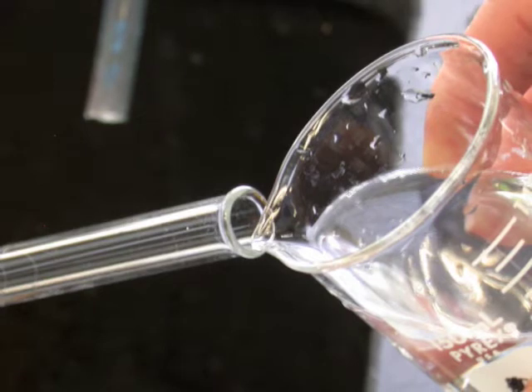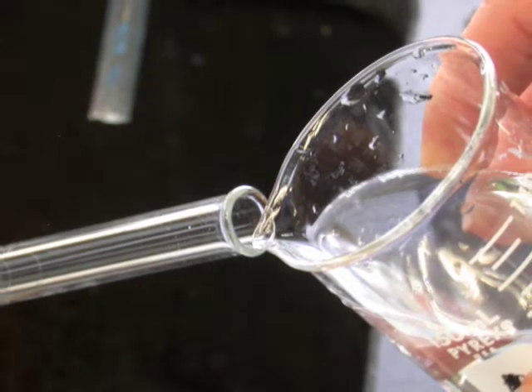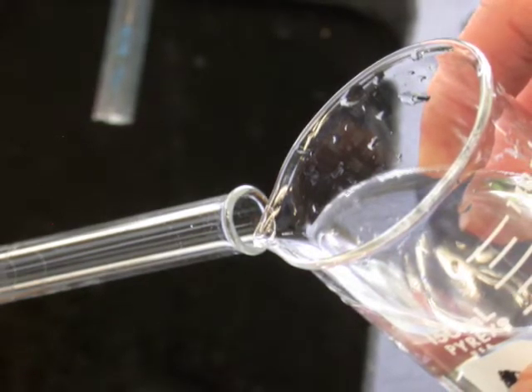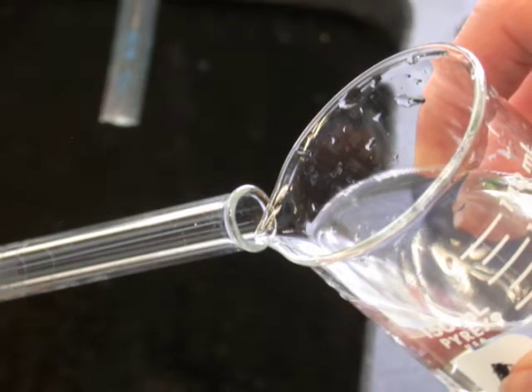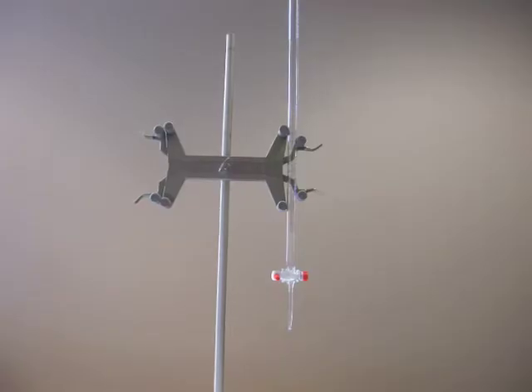Rinse the burette thoroughly, first with tap water and then with deionized water. Use a beaker to pour into the top of the burette rather than trying to hold the opening of the burette under the faucet.